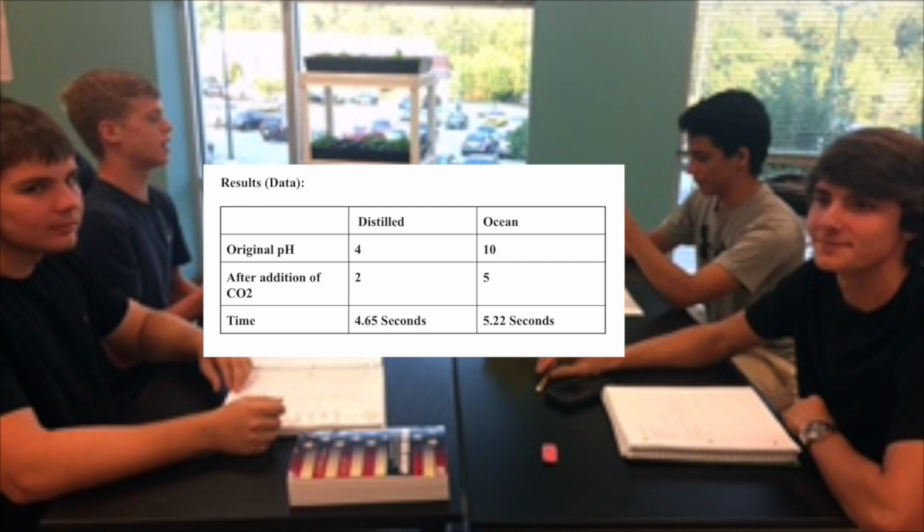For the first group, the original pH of the distilled water was 4, and after they added the carbon dioxide, the pH went to 2. It took 4.65 seconds for their distilled water to change colors. So we both found that the pH of the distilled water decreased afterwards, becoming more acidic, and took about 5 seconds to change colors. The original pH of the ocean water was 10, and after they added the carbon dioxide, the pH went to 5. It took 5.22 seconds for it to change colors. The ocean water became more acidic after adding carbon dioxide in both of our findings. However, one difference was that our group's ocean water took 12.44 seconds to change, while their group's only took 5.22 seconds to change.